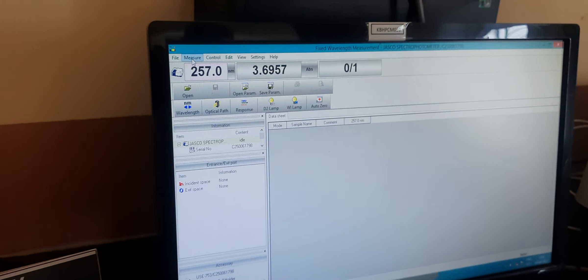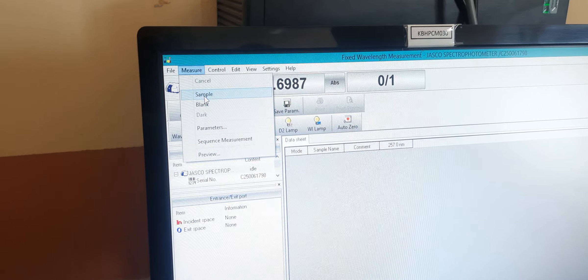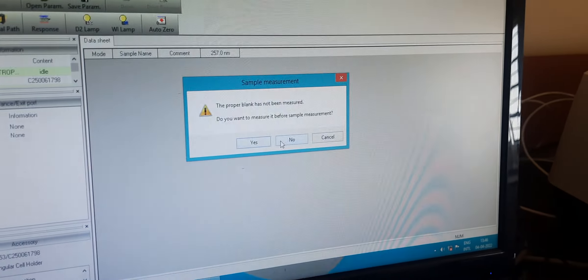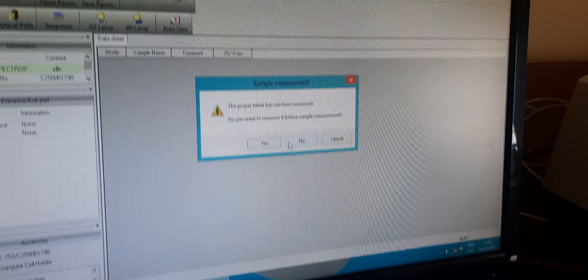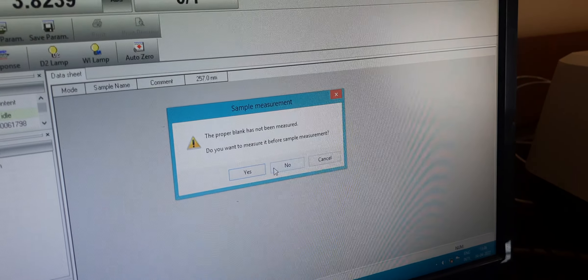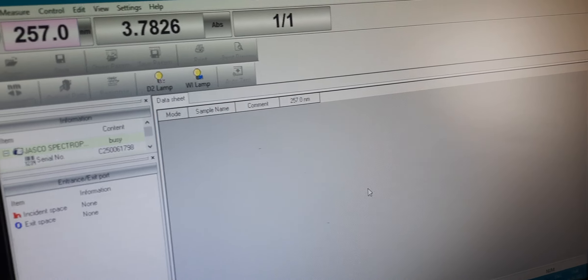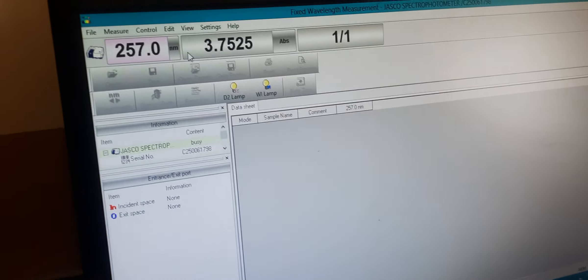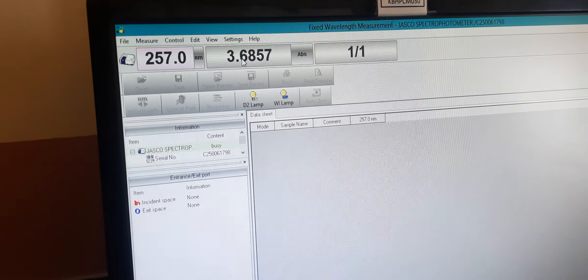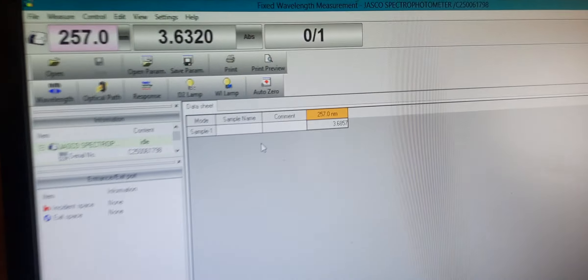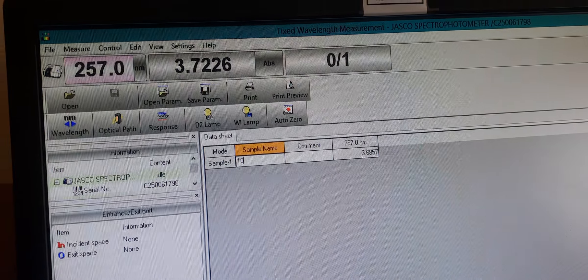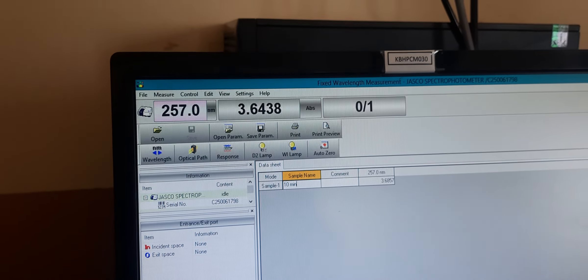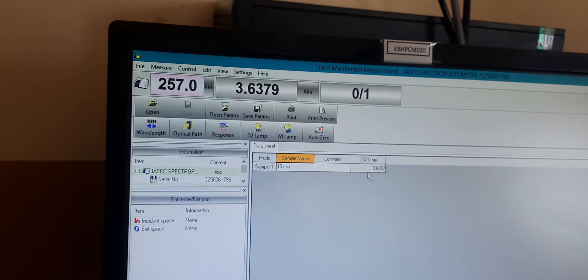Then click the measure button, select sample, and click no. Here you can observe the absorbance of our drug at 10 minutes. Put in the sample name: 10-minute paracetamol sample.